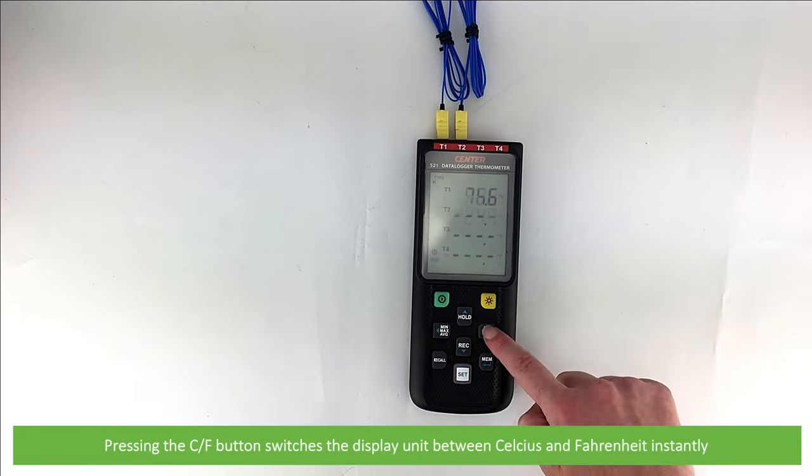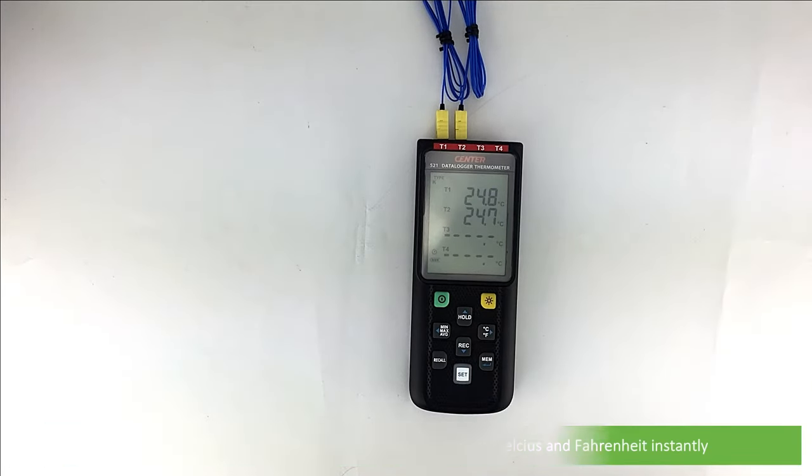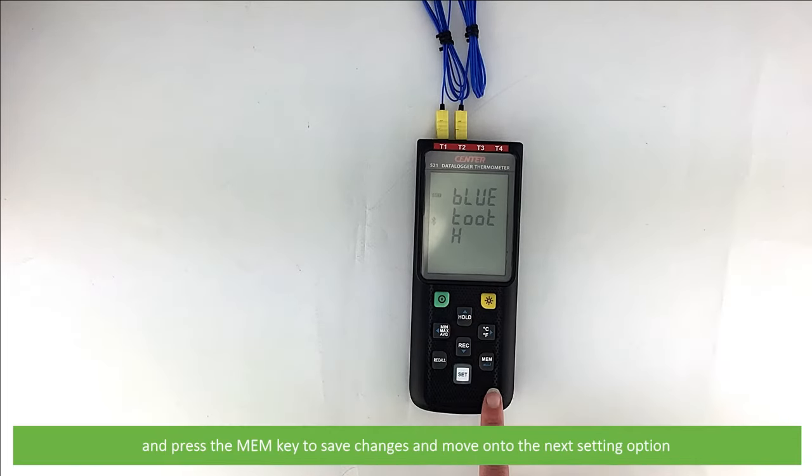Pressing the C/F button switches the display between Celsius and Fahrenheit instantly. Pressing set enters the setup menu. Within the setup menu, press the up, down, left, right arrows to adjust parameters or move setting items, and press the mem key to save changes and move on to the next setting option.